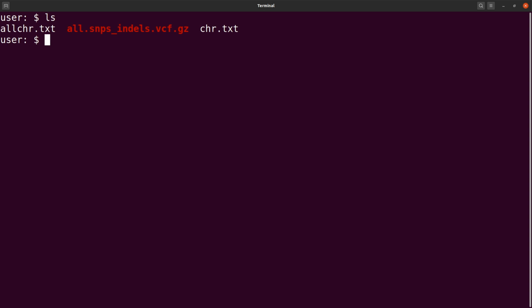So let's say you want the first 5 chromosomes. You can just say head. This time let's begin with the text files. So let's use this one here. From this list you can say head -n 5 and then call the text file. So you have them here: 10, 11, 12, 13, 14.